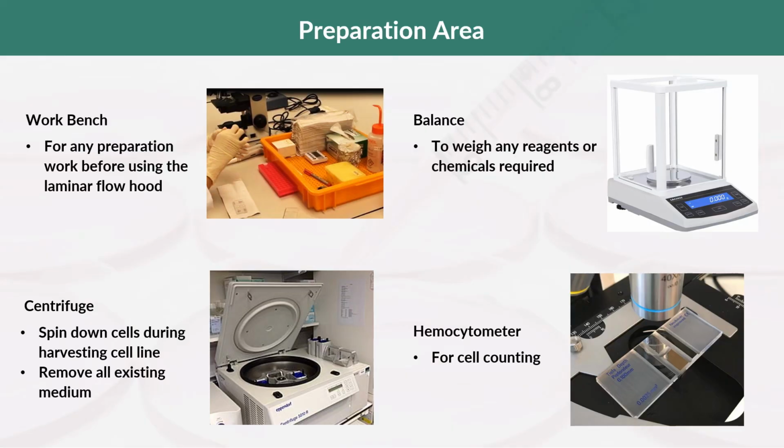They have the swing out and the fixed angle, so they have different size buckets. Okay, so all variety types, because they want to be compatible, to accommodate the different kinds of tubes or plates that you're using. Okay, so they are generally very useful equipment, always found in all cell culture labs.